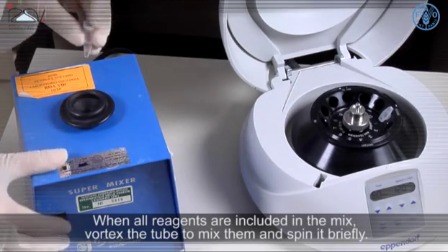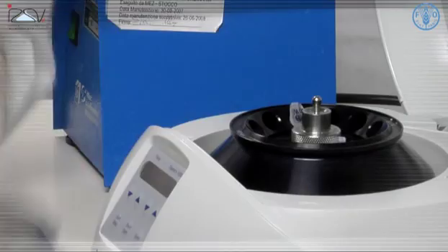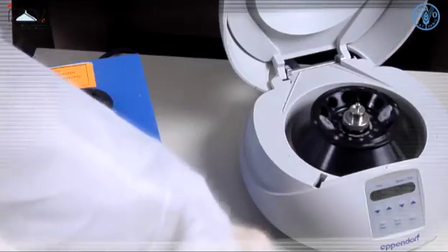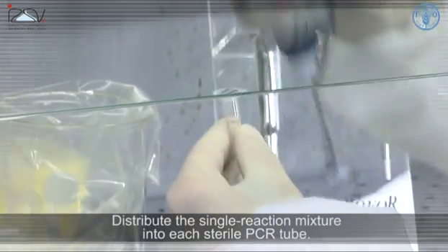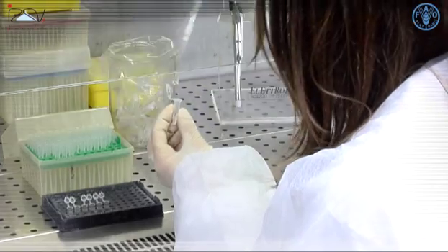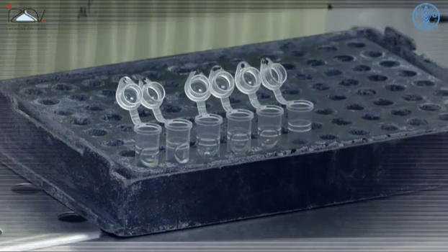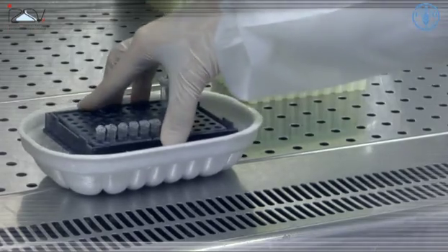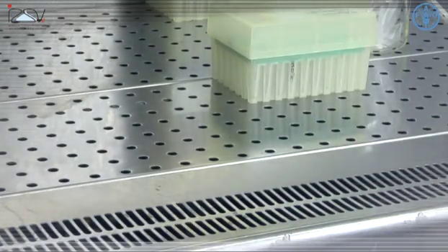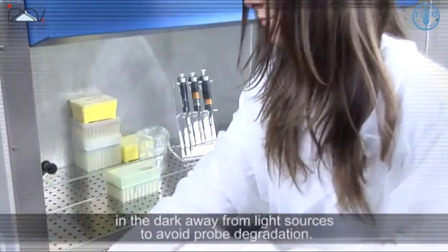When all the reagents are included in the mix, vortex the tube to mix them and spin it briefly. Distribute the single reaction mixture into each sterile PCR tube. If the mix contains fluorescent probes, remember to keep the tube in the dark and away from light sources to avoid probe degradation.